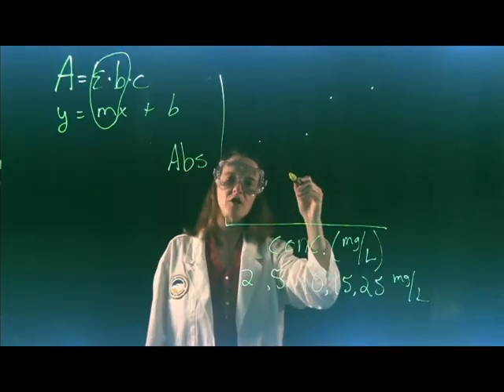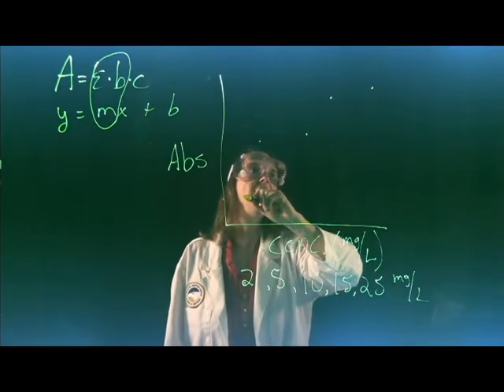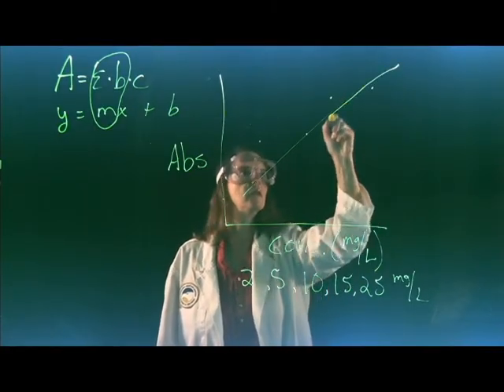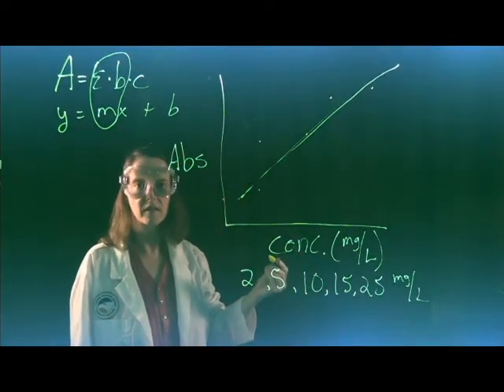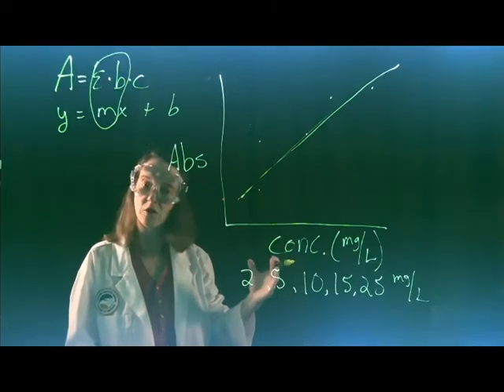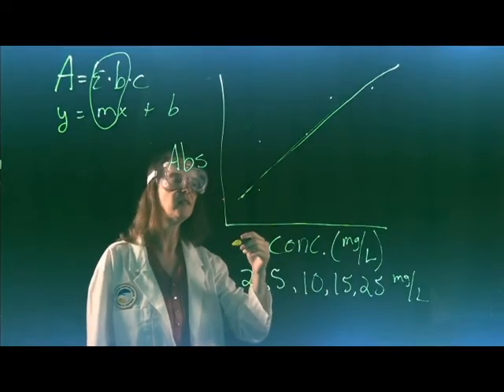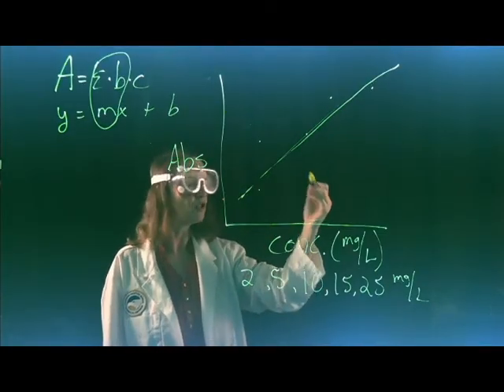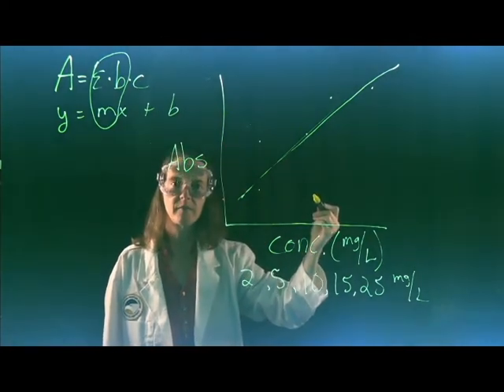So if you go back to your data and draw the best fit straight line, something like this. You'll either be using the LabQuest device to draw this line or Excel. In one case, you'll be doing it by hand, and you'll want to use a ruler to draw the best straight line. And from this, you can get the value of the slope and the y-intercept.